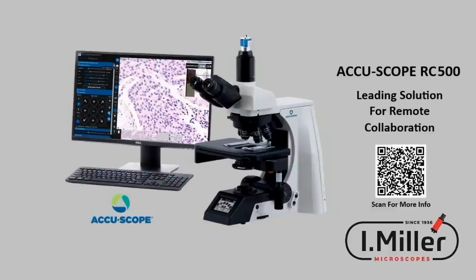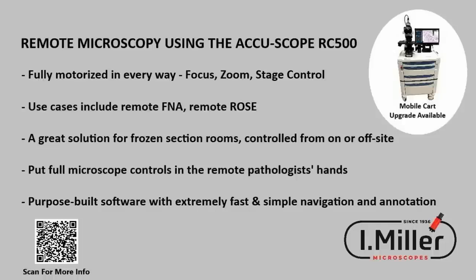Today we are highlighting the ACCU-SCOPE RC500. It's a brand new product from ACCU-SCOPE for remote collaboration. Remote collaboration in the clinical space means that you can use this, which is a fully motorized microscope, for applications such as remote FNAs or rapid on-site evaluation procedures, and it makes a great tool in a frozen section room, whether that frozen section room is on site or at a satellite location. As a motorized microscope, it allows the remote user, the pathologist at a remote location, to fully control this microscope.